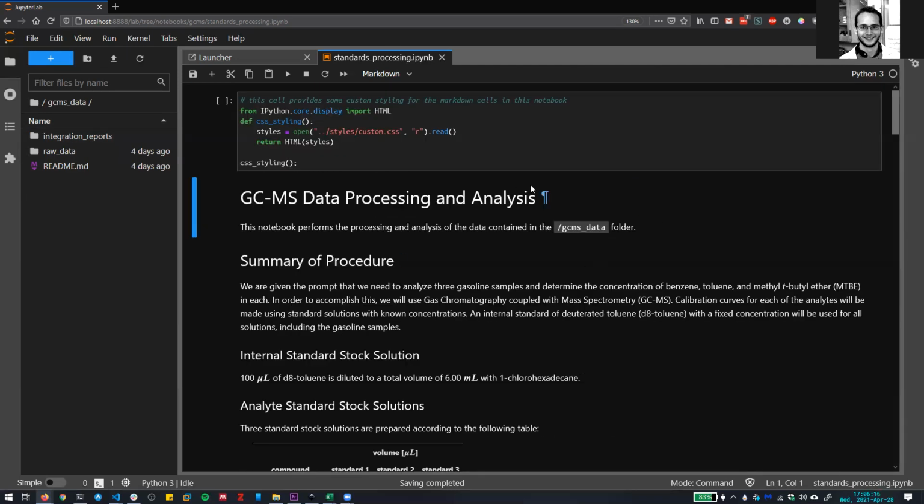I've been working on this for a little bit. In the future, I'll be making more changes to this code so that you can read in the raw data as well, so that you can basically circumvent using OpenChrome at all and do everything in Python. That's a little bit extra work, and I'm not expecting you to do that, obviously, but I just want to give you the tools so that you have a reference for this project in the future. It's got a lot of good practices in Python.